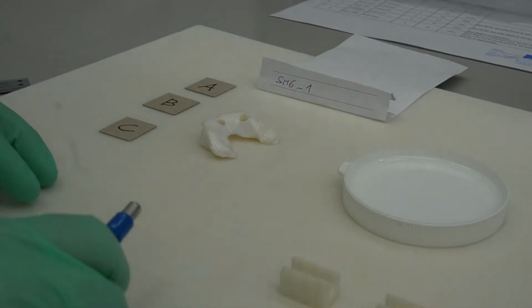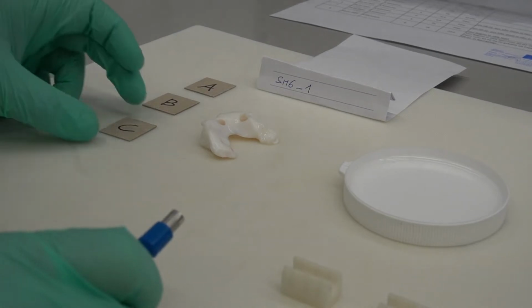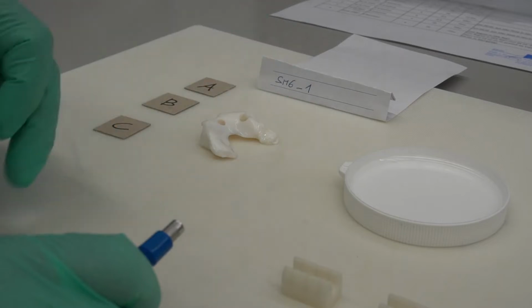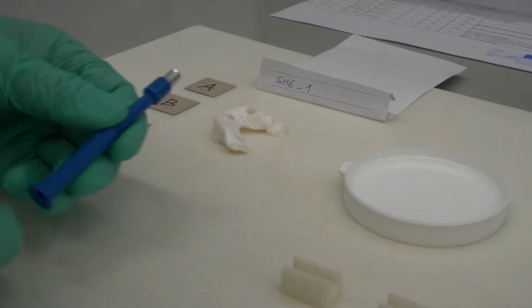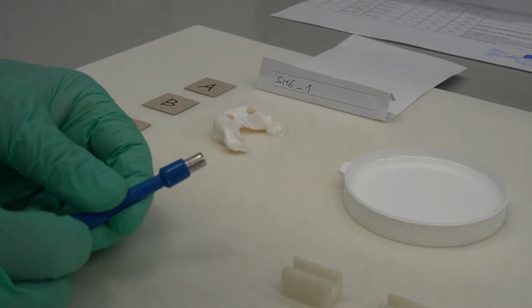So what I always do is I try to keep as much information visible and clear all the time. So this is sample number SM6_1. We have cylinder position ABC, and I'm now extracting cylinder number C with this tissue punch of 6 millimeter diameter.